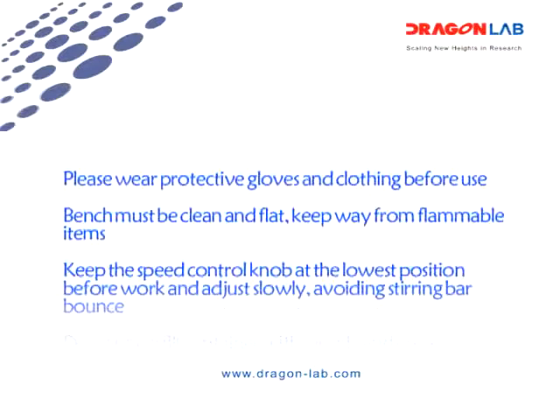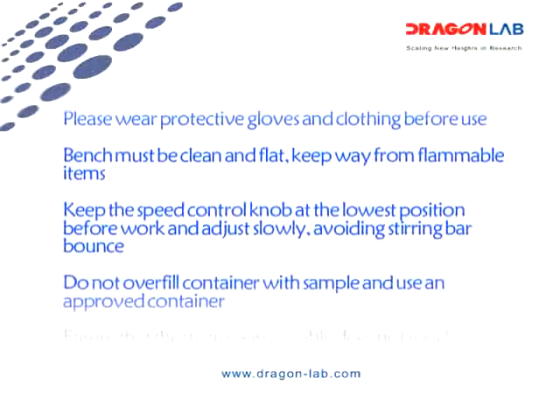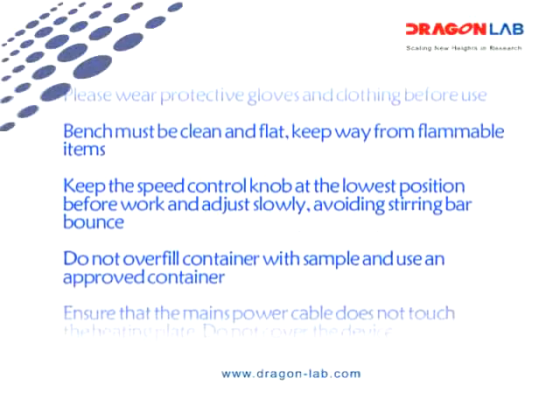Keep the speed control knob at the lowest position before work and adjust slowly. Avoid stirring with unsuitable bars.